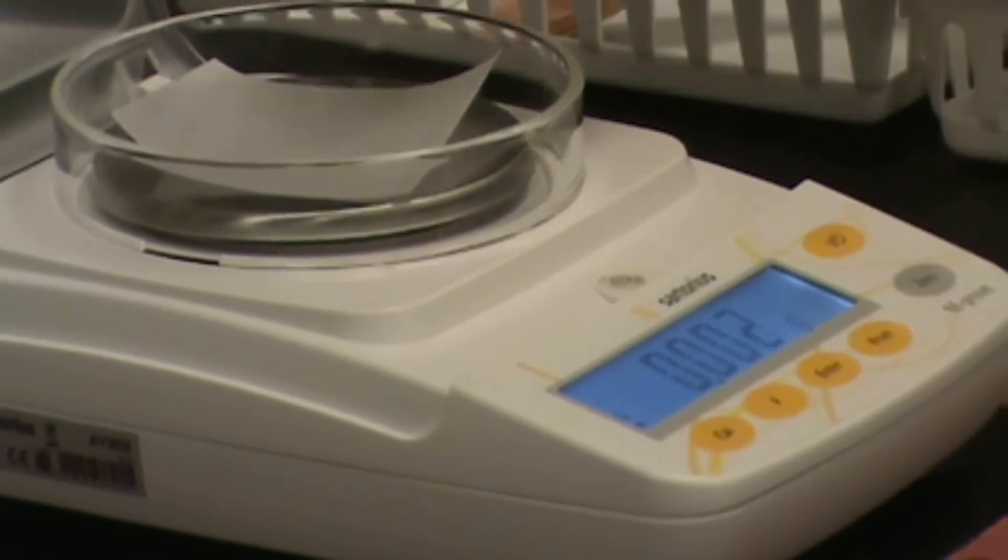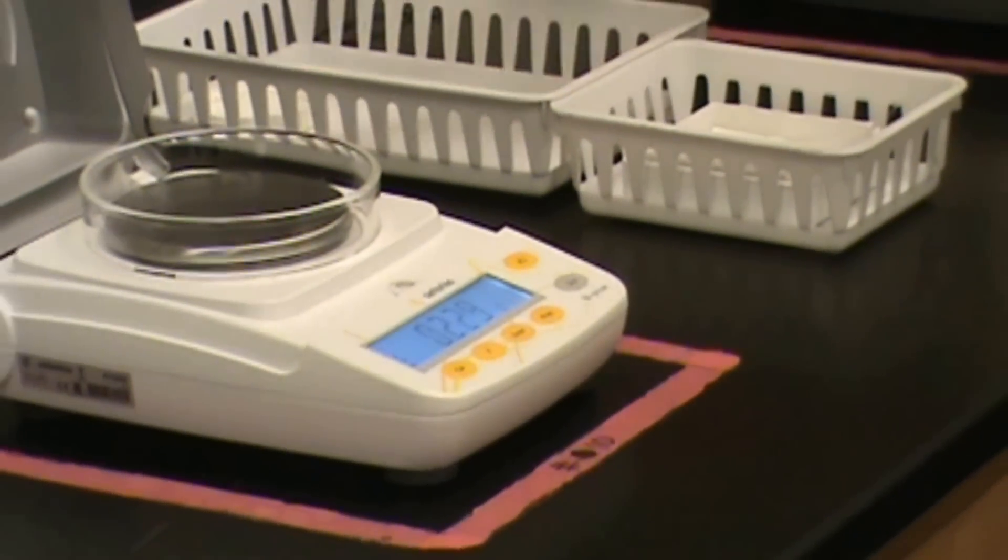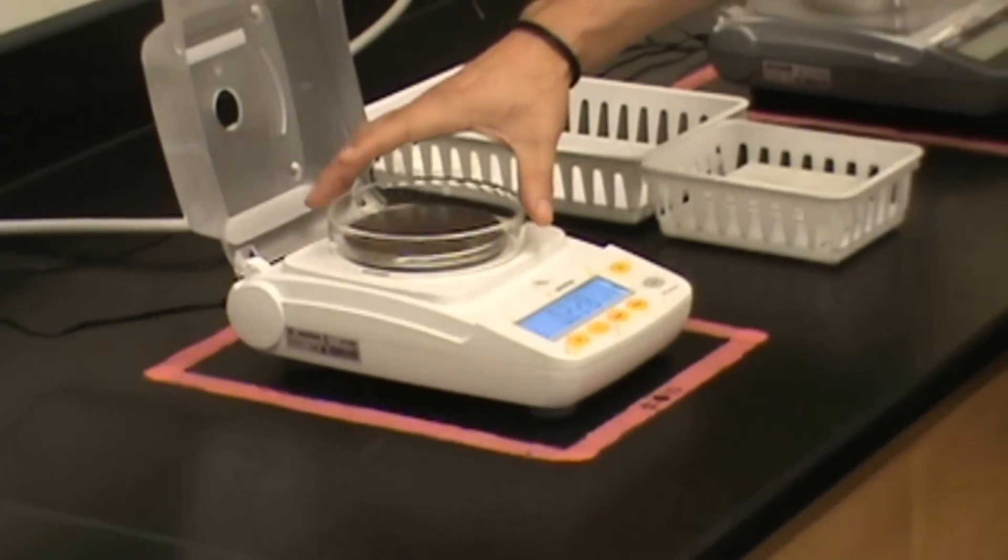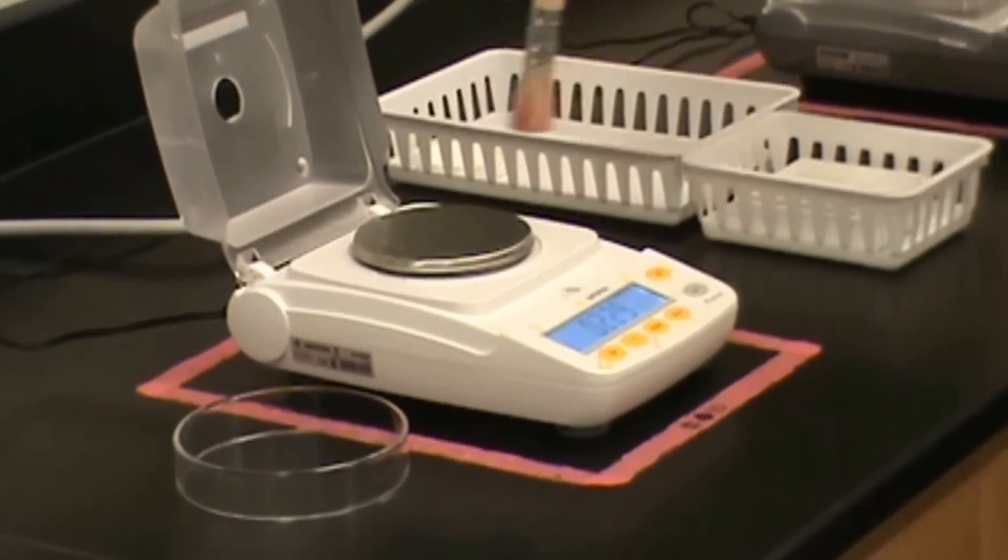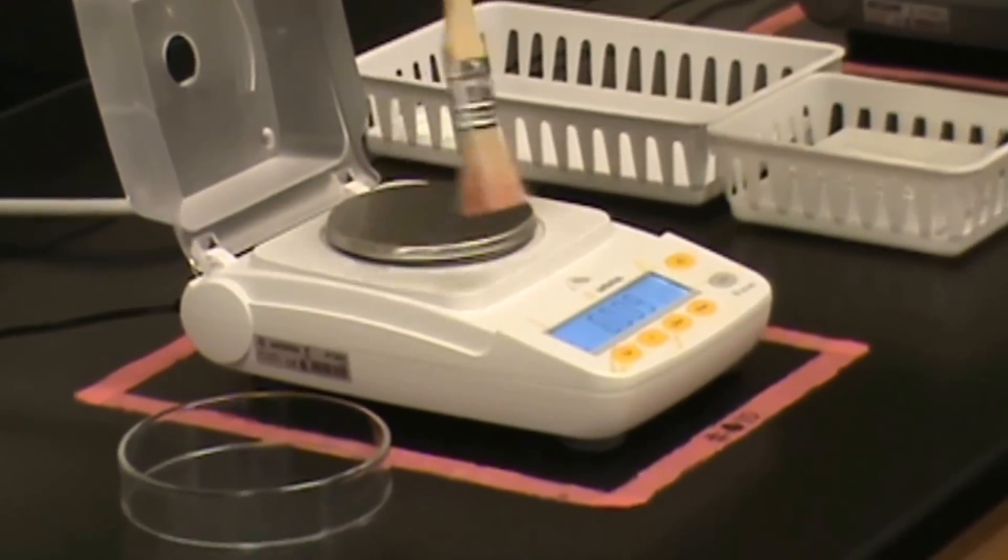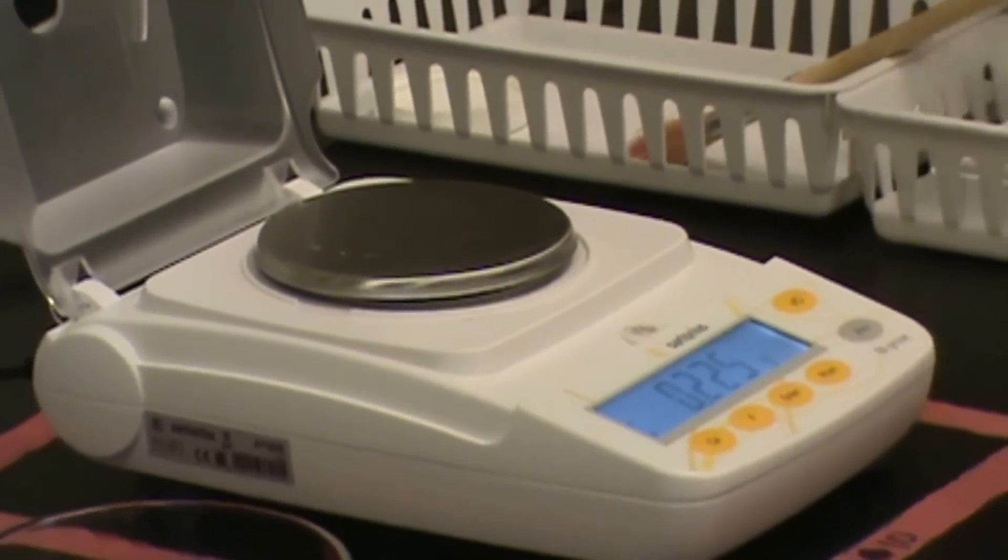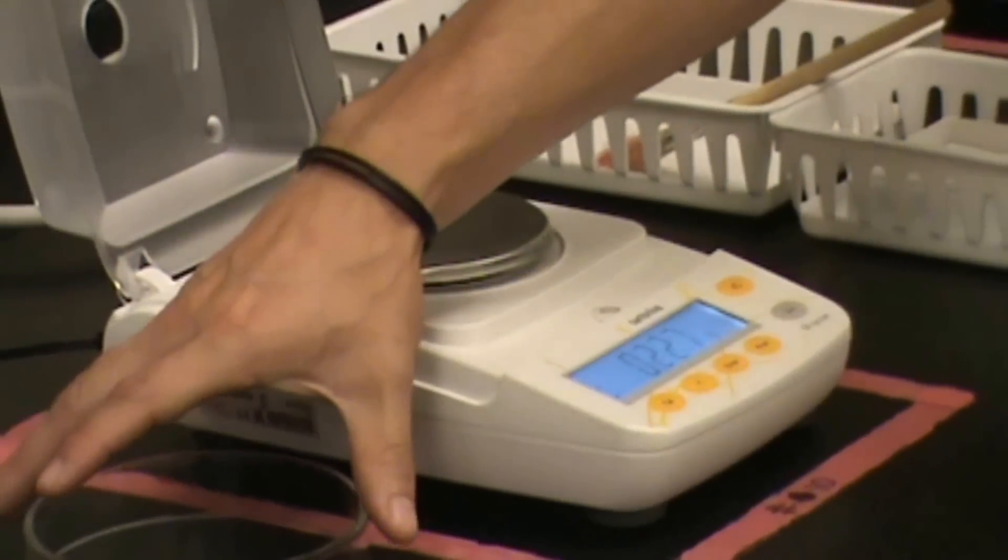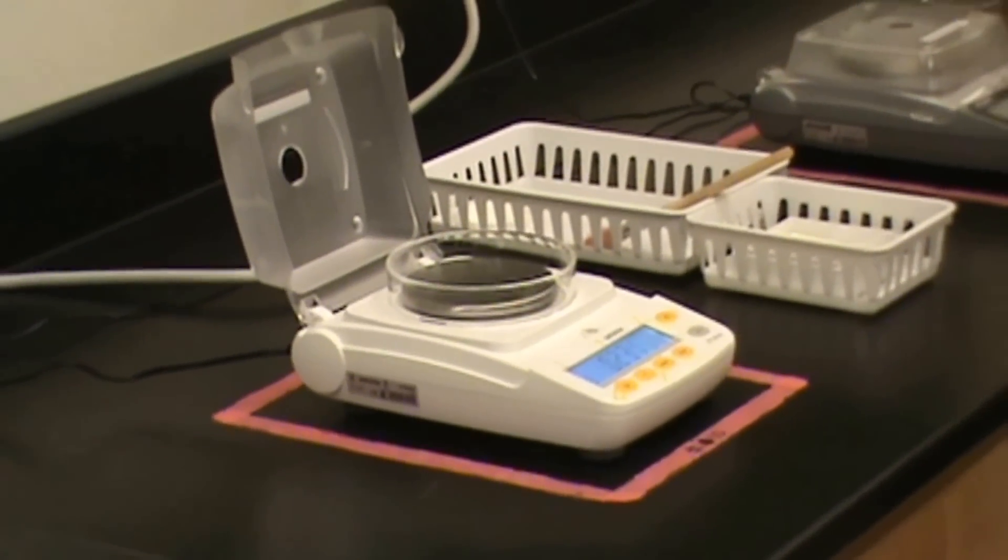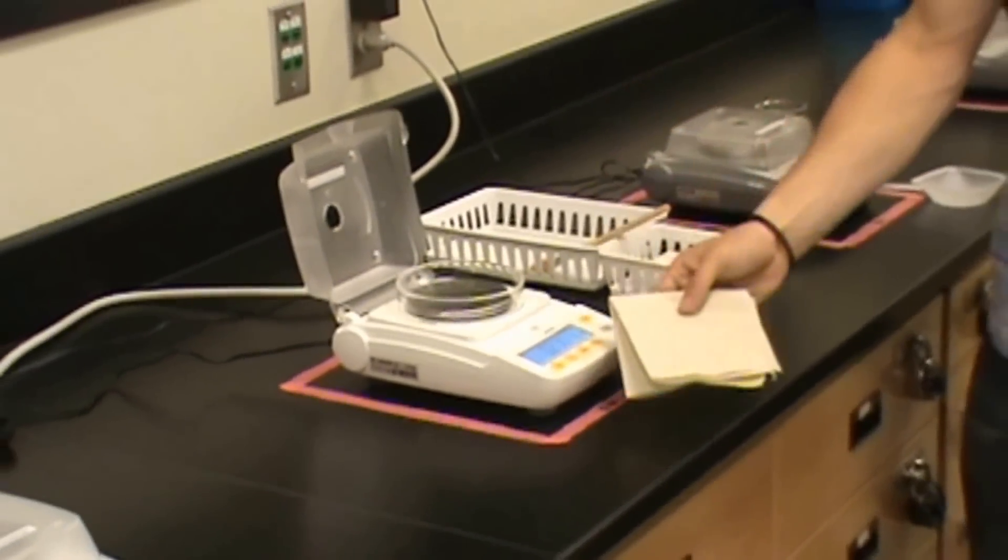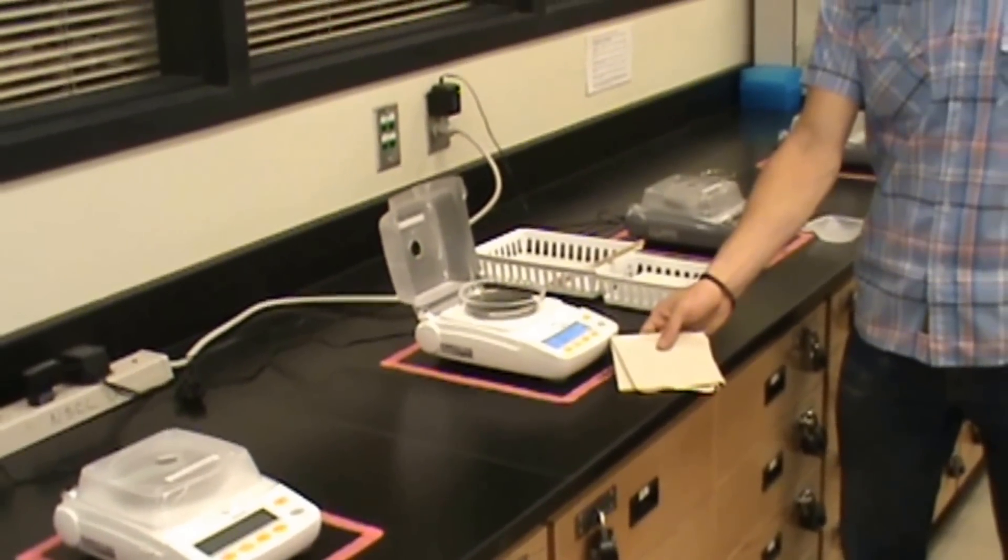When you're finished using the balance, you want to make sure that you've cleaned the balance. In order to do that, you'll want to use a brush and you'll probably need to remove the wind guard. The brush can be used to brush off any chemicals that might have fallen on the balance. Should you make a mess of the counter while cleaning the balance, I recommend that you use a damp paper towel to wipe down the counter. You want to leave the workspace at least as clean as when you found it.